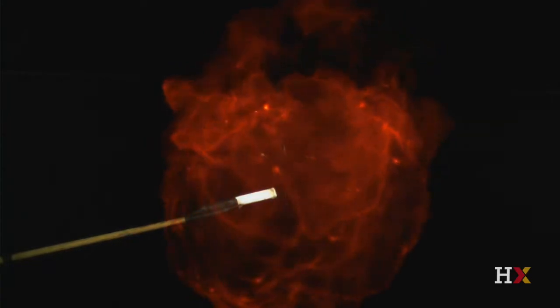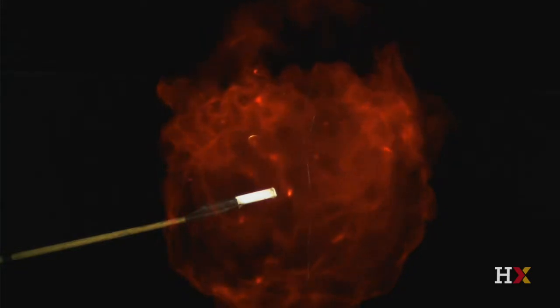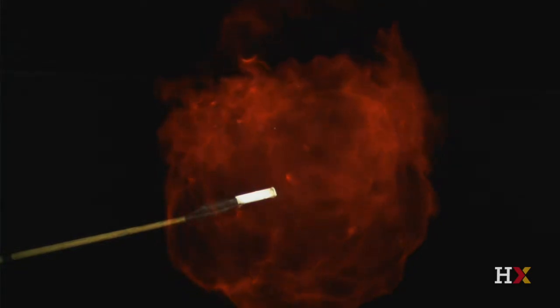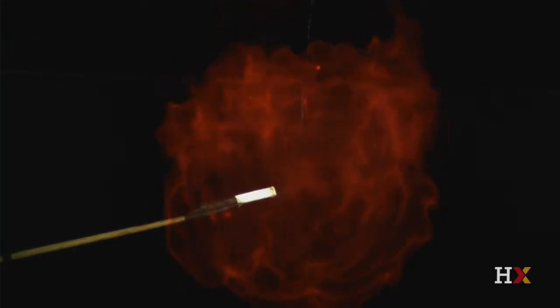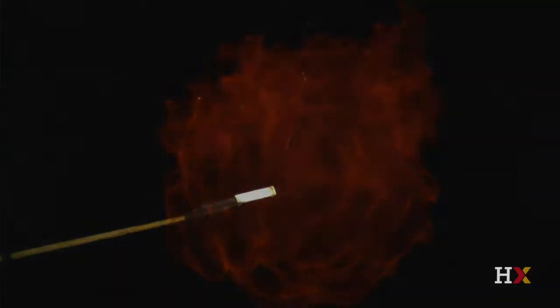The reaction between hydrogen and oxygen gas molecules continues as diffusion allows the hydrogen and oxygen molecules to come into contact with each other until all of the hydrogen from the balloon has been consumed.